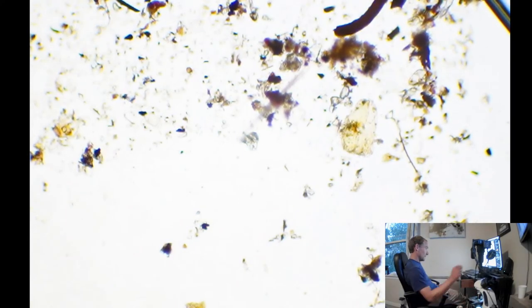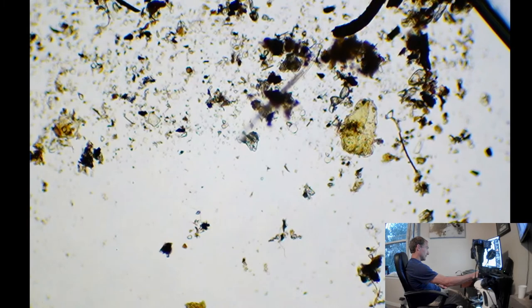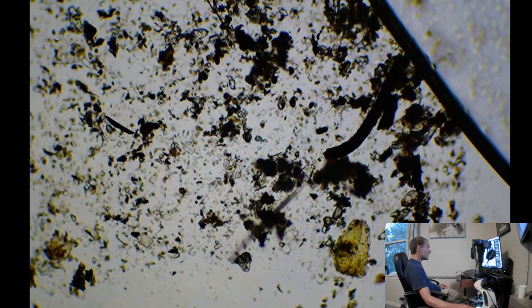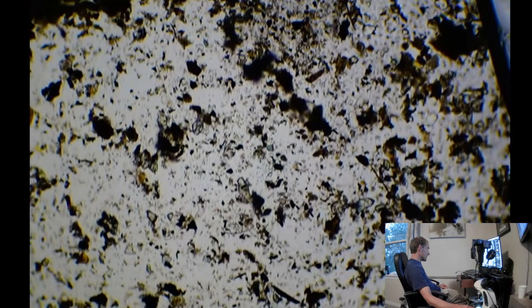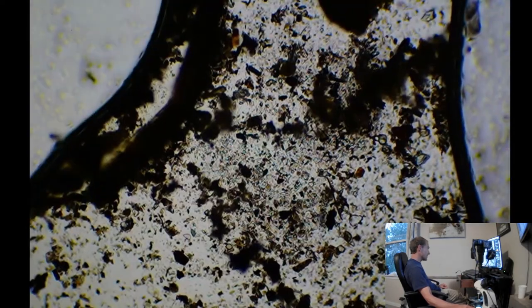Alright, we're gonna go back out to 100, do a little bit more scanning around. Oh, yeah, we gotta adjust our light. Oh, wrong way. Yeah, right. Good things that you want to see. All right, let's go up a little bit more. See if we can find anything else.